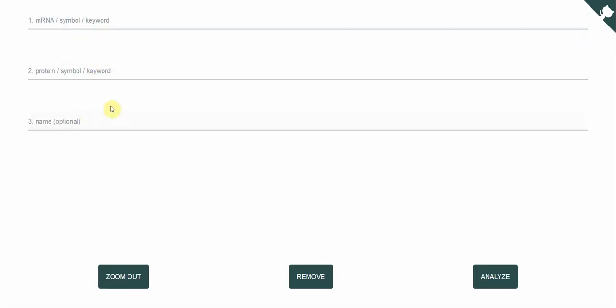So you have three fields and the first field is the mRNA. This is where you put your mRNA sequence, underneath you have the protein sequence and underneath you have the name, which is optional.